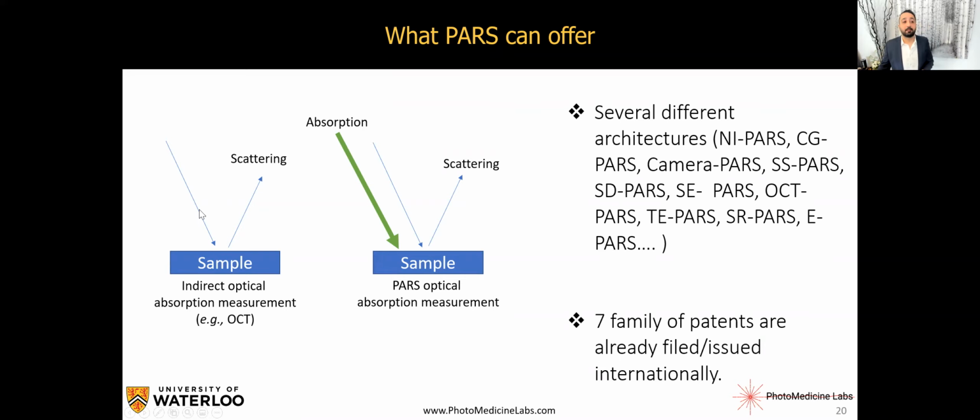They send a beam to the sample and collect the reflection of that laser. The less light reflecting or scattering back, they assume more absorption is happening in the sample. This cannot be very accurate, because the size and shape of the sample can really affect the amount of scattered light coming back. Also, in subsurfaces, there might be different structures that change the amount of scattering.